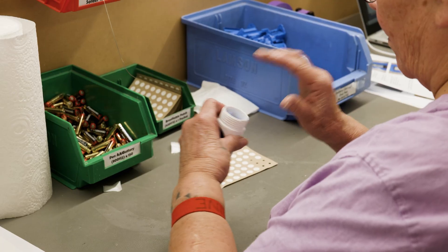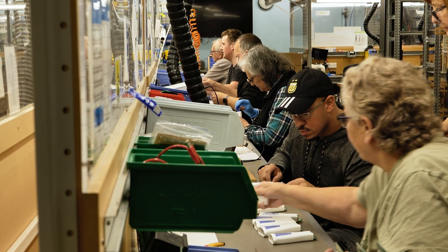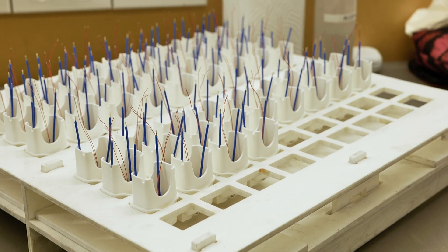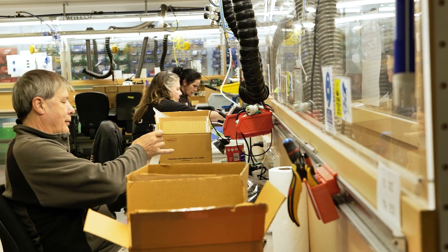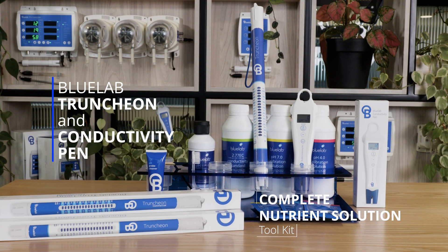We're proud to design and manufacture all our products right here in our factory in New Zealand, including the Truncheon and the Conductivity Pen. That means top-notch quality and performance you can rely on. The Bluelab Truncheon and Conductivity Pen — your complete nutrient solution toolkit.